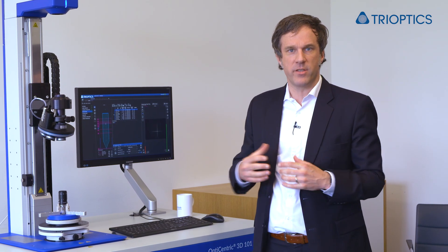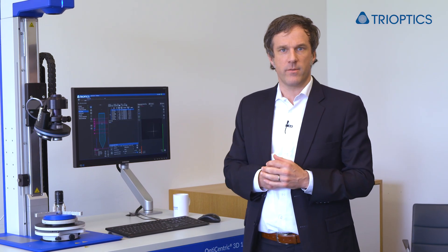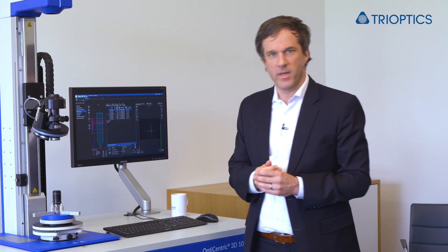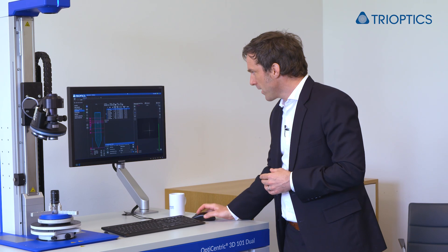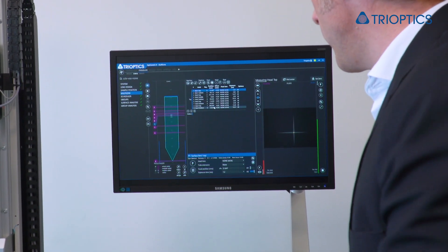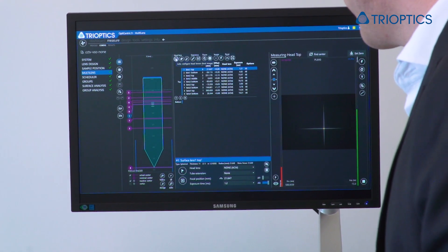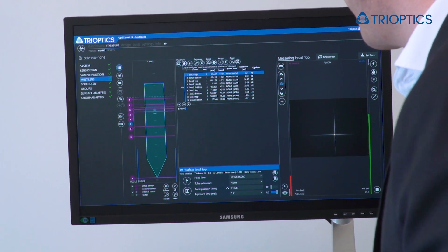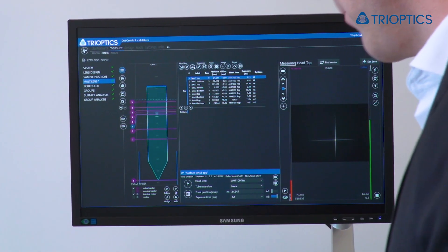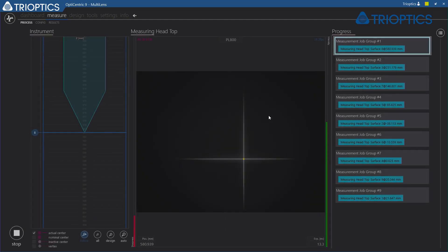Depending on the method of changing the headlenses — whether it's fully manual with a manual headlens changer or with a motorized turret — the system will automatically set the ideal configuration. As you can see here in the software, in the configuration tab we have the lens prescription. In our case it's a nine-surface sample, and the headlens selection can be done either for best image quality, minimum number of headlens changes, or a proposal based on the type of headlens changer. And that's all we have to do — I can save this configuration and directly start with the measurement process.